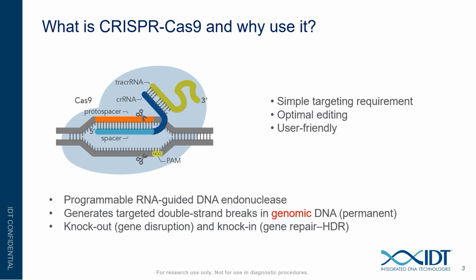Now, let's get started with the introduction of CRISPR technology by taking Cas9 as an example. CRISPR is an acronym for clustered regularly interspaced short palindromic repeats that was discovered in the early 2000s, functioning as a defense system in bacteria against foreign materials such as pathogen nucleic acids. Over the years, scientists managed to discover and identify the essential components in the system for genome editing purposes.